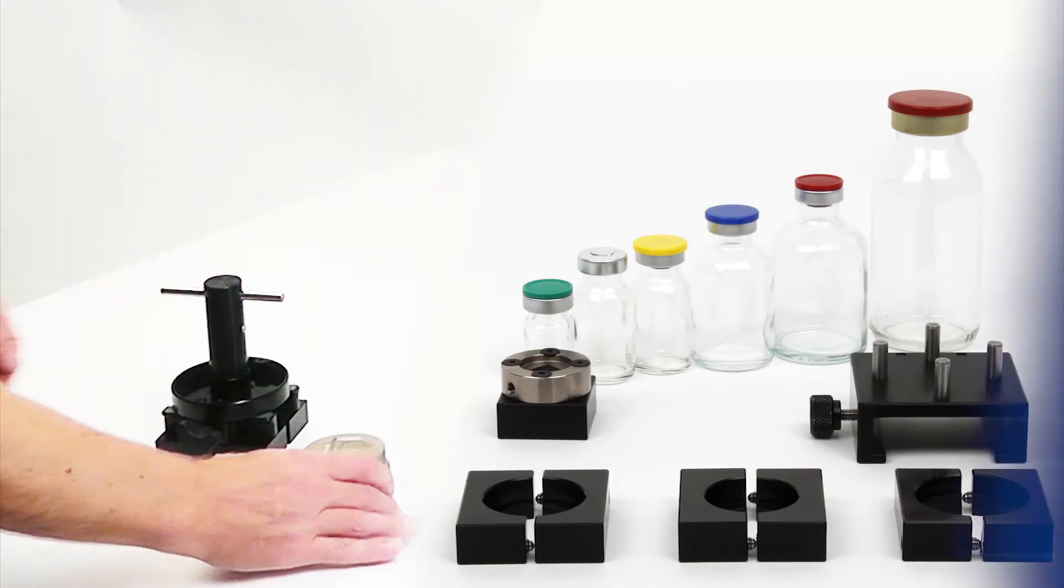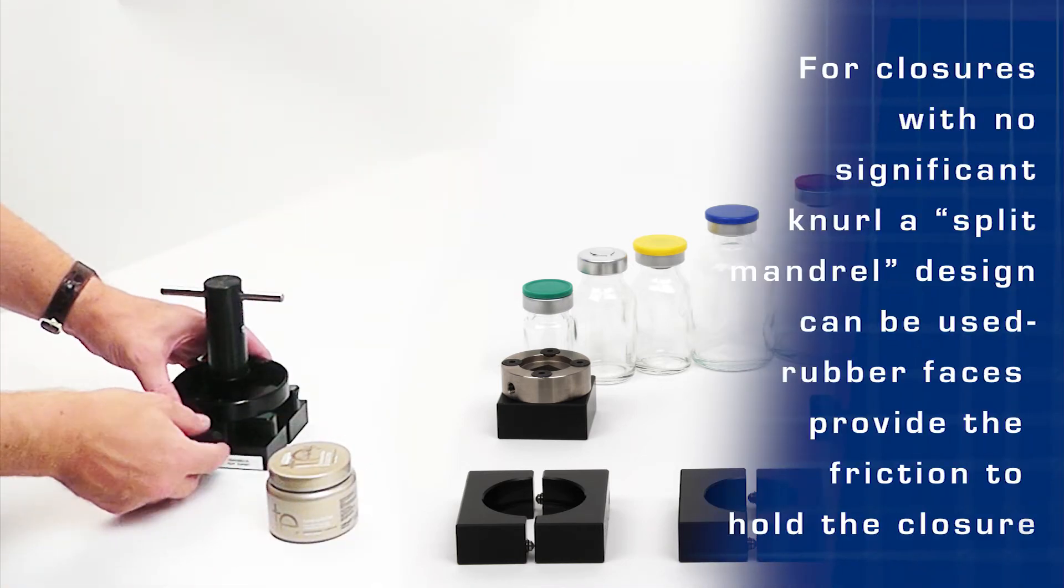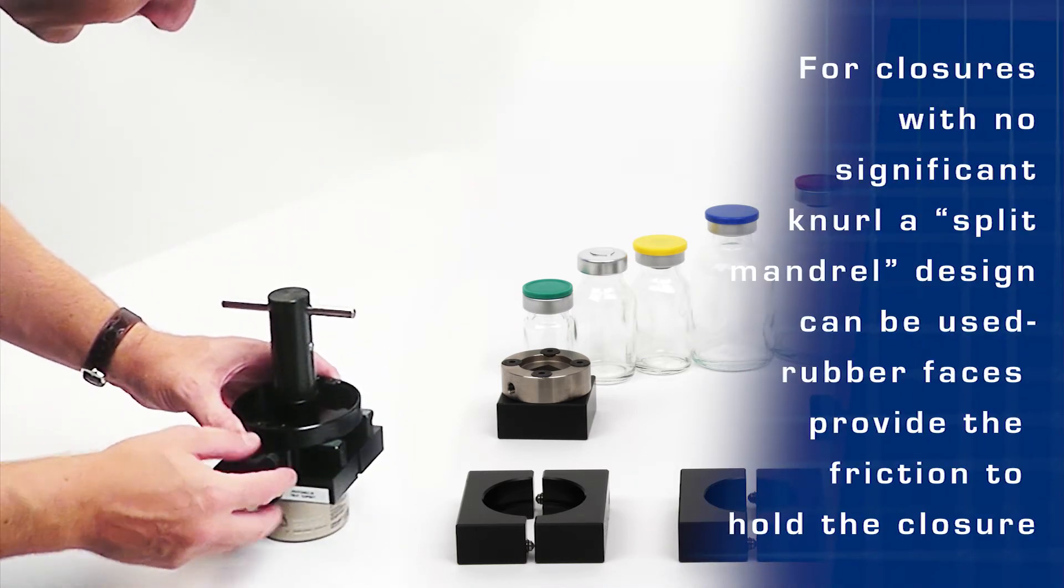For closures without significant knurl, a split mandrel design can be used. Here, rubber faces provide the friction to hold the closure.